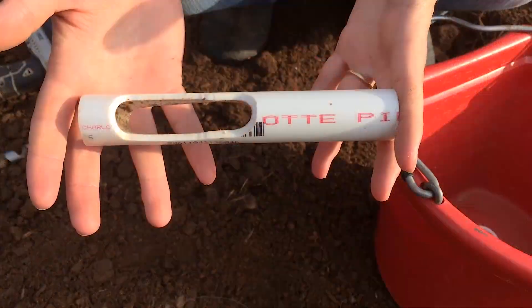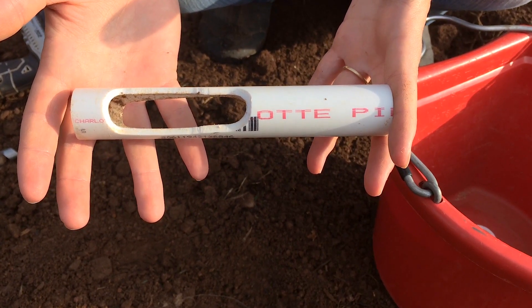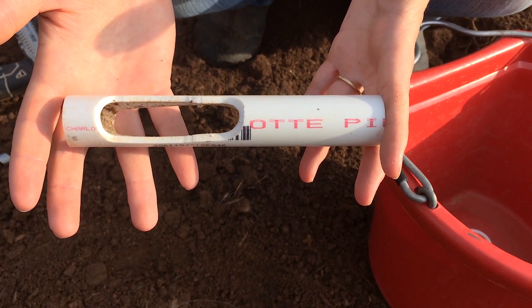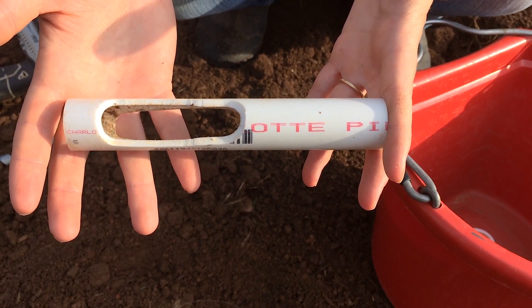I also like the addition of a depth guard. This depth guard controls how deep your soil sample is, so you can take a consistent six inch or eight inch soil sample the entire time.